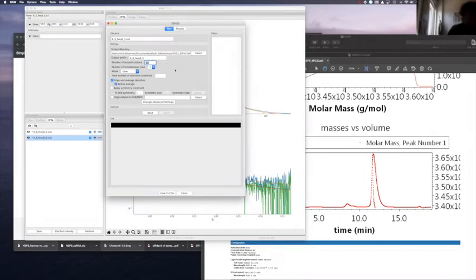For the sake of time, I will not start it, but it takes about, oh, why not? We're going to put it in fast mode, and we're going to calculate only 5 reconstructions. I know it is almost a monomer with about 20 something, but I don't apply the symmetry in this case.